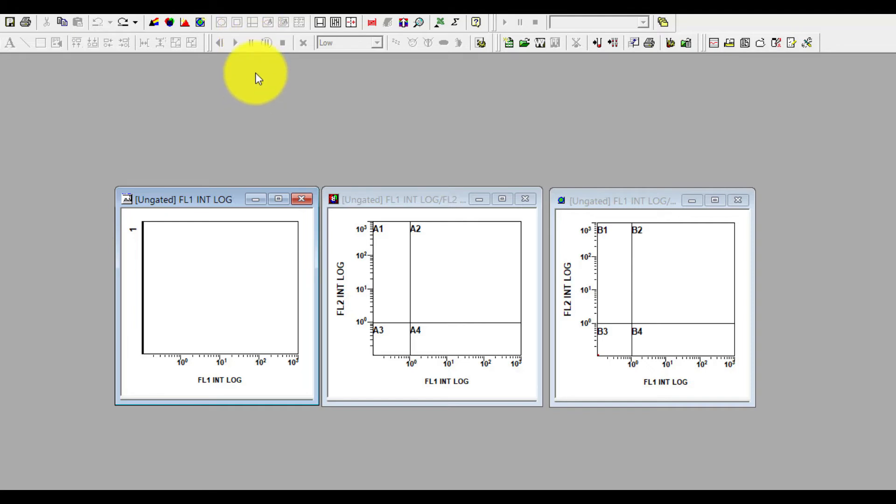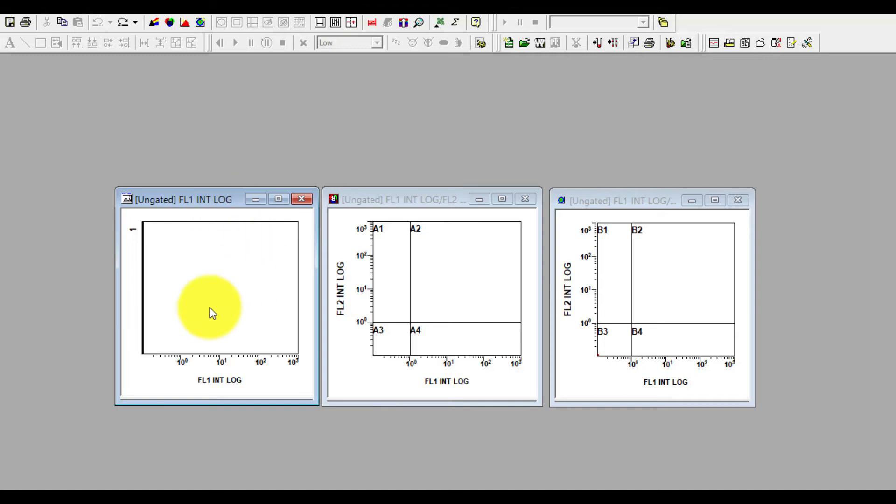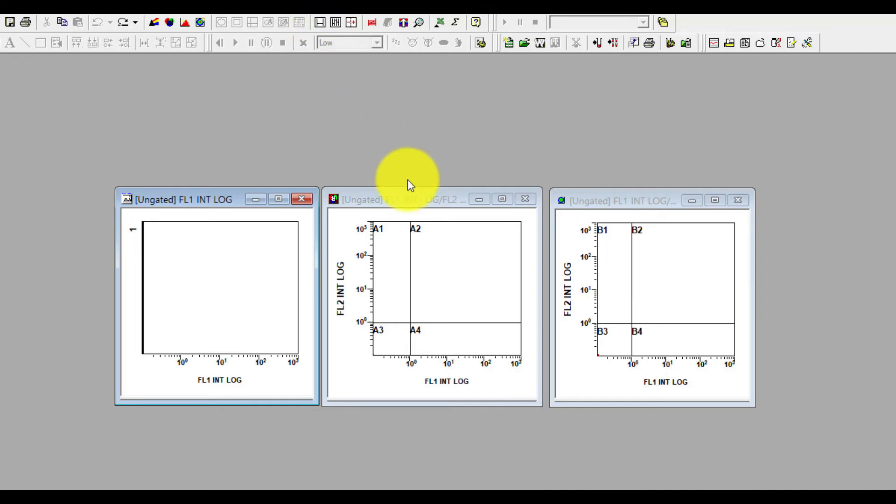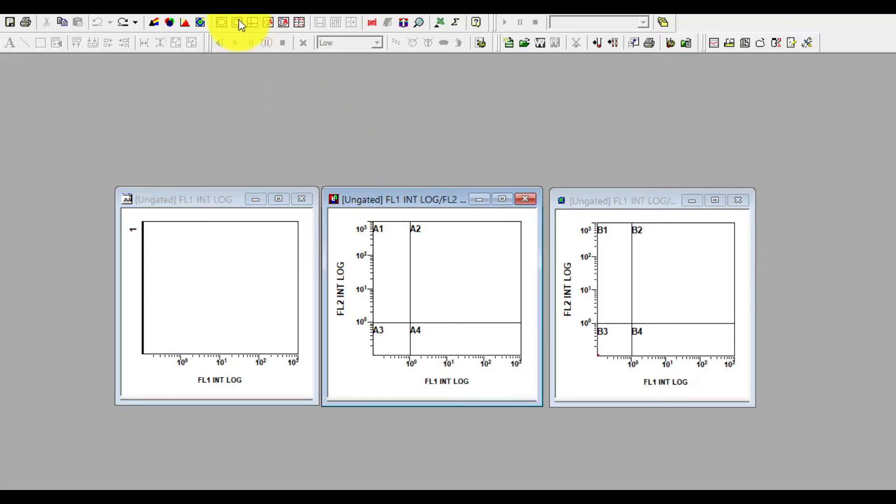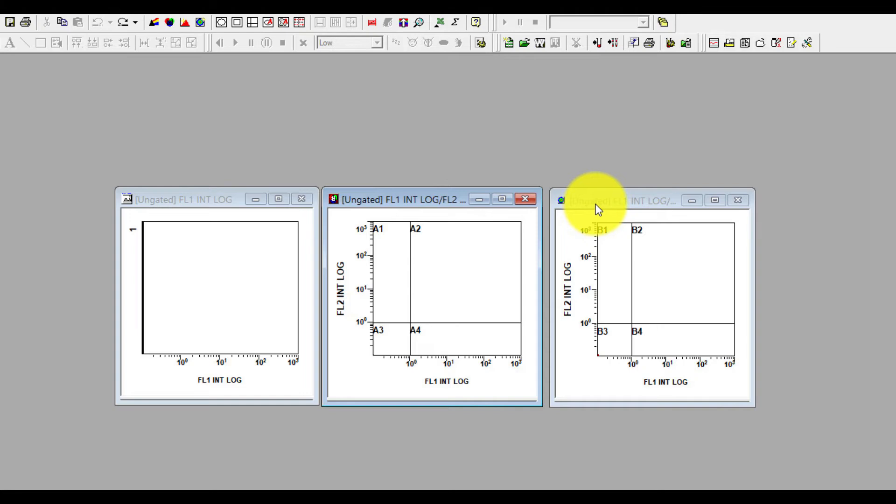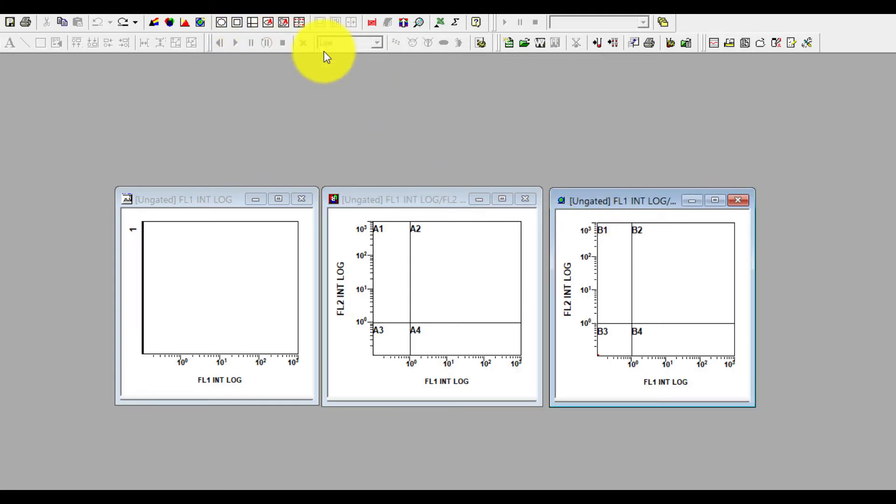If you see, once I click the histogram I can't make a quadrant region. But if you notice, the linear single linear region is appearing. If I click the dot plot and now if I check, I have an option of quadrant but there is no more option of the linear region, which shows me and confirms that you can't make any quadrant in the histogram and vice versa for the dot plot.